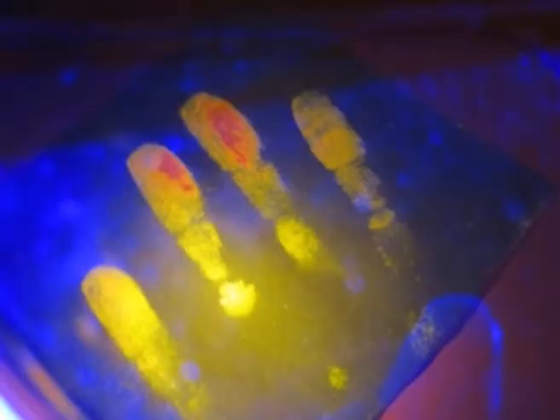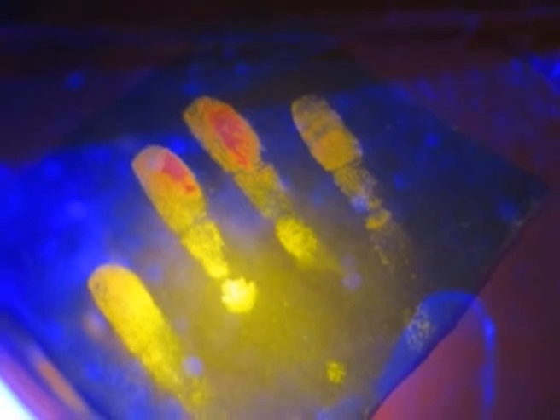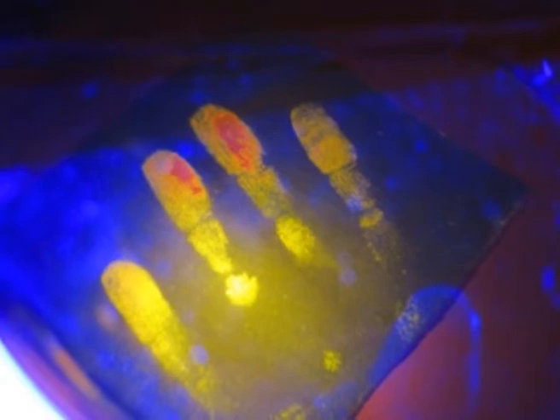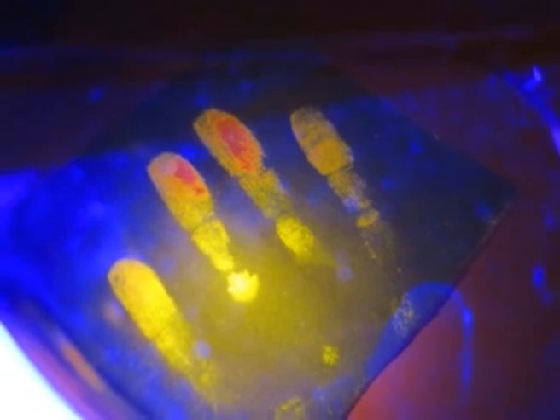The DFO technique offers the following advantages over the Ninhydrin methodology. First, with DFO, a strong room temperature luminescence of developed prints is observed without any secondary treatment. Against this, the Ninhydrin developed prints have to be post-treated with a suitable metal salt to produce luminescence. Good results are obtained if the exhibit is cooled to minus 200 degrees centigrade during the fluorescence examination.